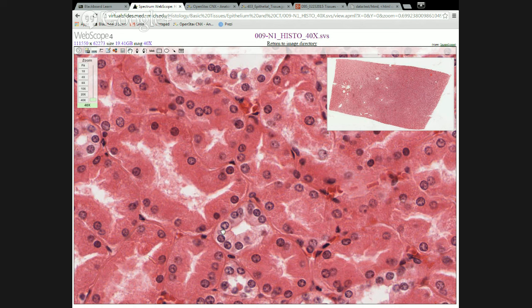Now, I picked this one out because it really stands out as being obviously a single layer of cells wrapped around, lining the inside of this tube. But actually, if we look at these other things that are a little bit fuzzier and harder to make out, we can still say the same thing. So like, there's a little empty space right here in the middle of this tube. It's just off to the side of the one I've been pointing at. And so the edge of the cells lining that empty space, that's the apical surface of all those cells. And then you can kind of see the hint of a line on the other side of each of those cells. That's the basal surface of all of those cells. Okay. So we're looking at a single layer of cells going around that little thing.